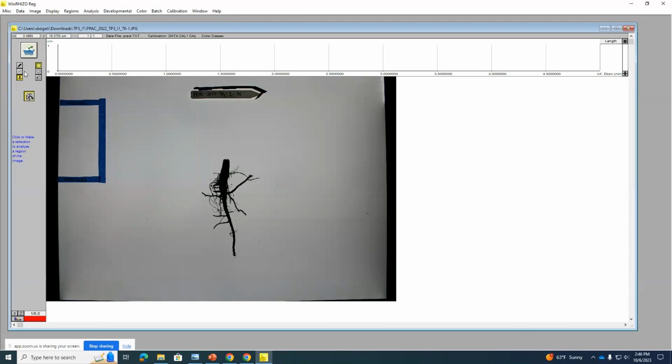So for this one, in the command area, there are so many options. First one is image edition mode. This one is just to add the roots manually or do some additions. You can just create the roots by yourself.